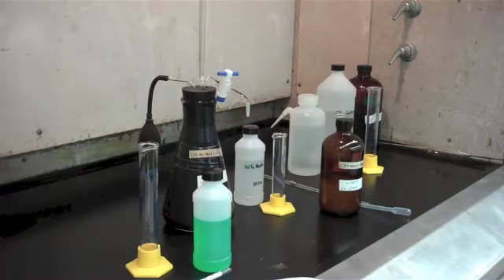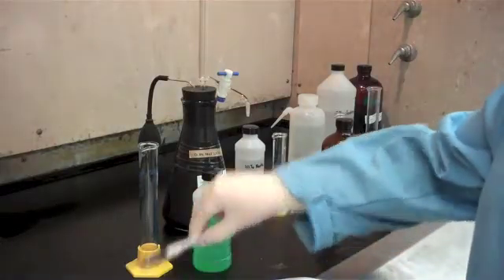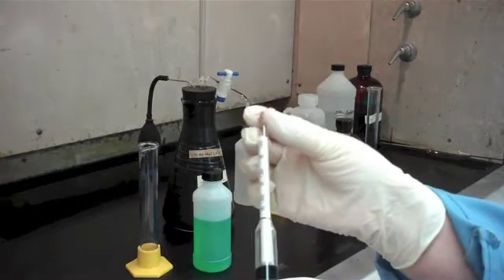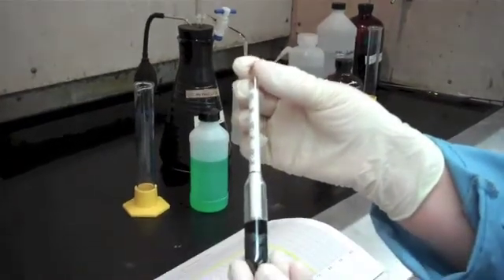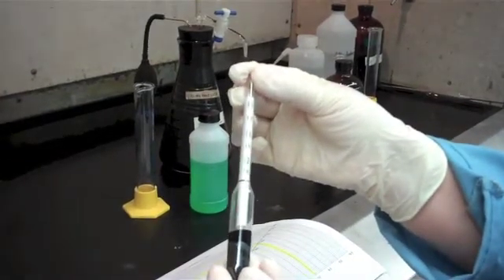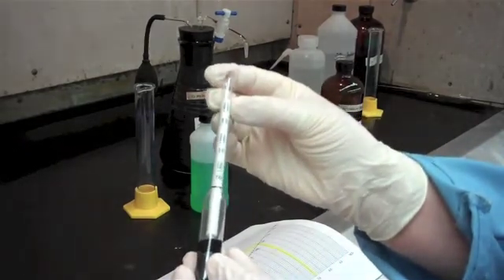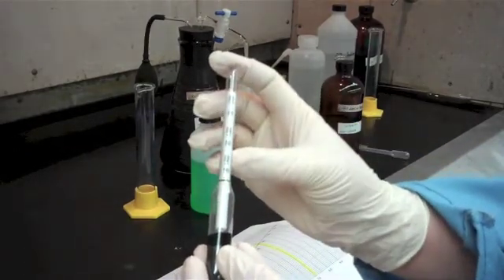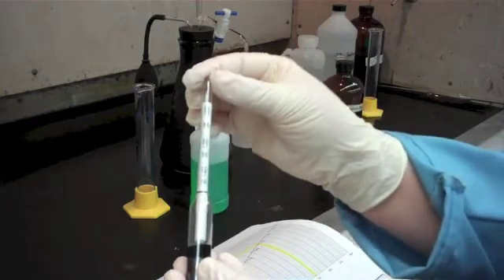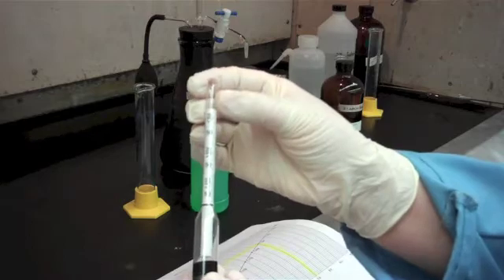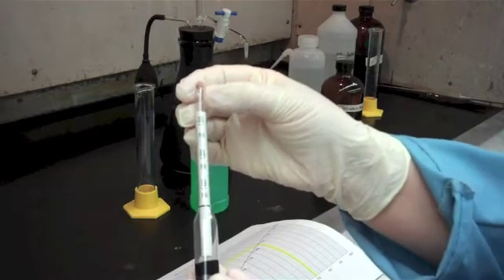For the specific gravity method, we will need to use a hydrometer. You can purchase these at any laboratory supply company, such as Fisher Scientific or VWR. They come in many different ranges. For this particular test, we will be using the range of 1.200 to 1.400 grams per milliliter. Each line represents 0.005 grams per milliliter.